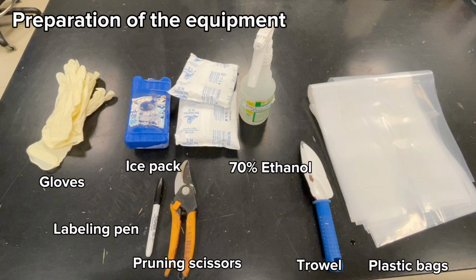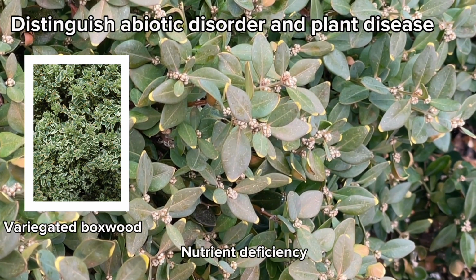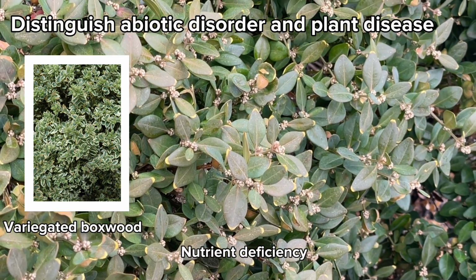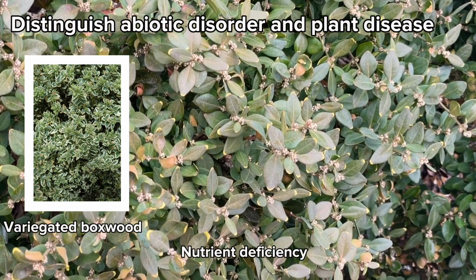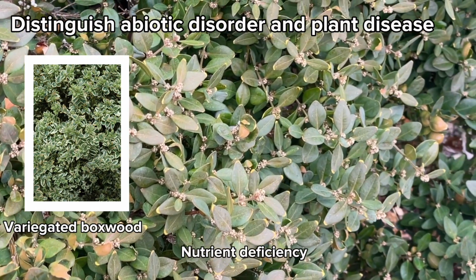For example, gloves, ice pack, 70% ethanol, clean tools such as pruning scissors, trowels, plastic bags, a label pen, a cooler, and field shoes. It is important to be able to distinguish between plant disease and abiotic disorder before visiting the field. Sometimes certain cultivars can appear diseased, but instead it is the normal appearance of the plant.